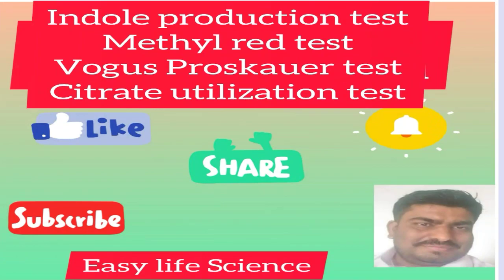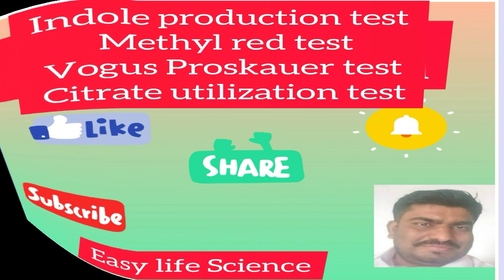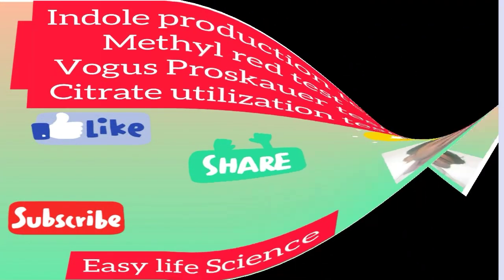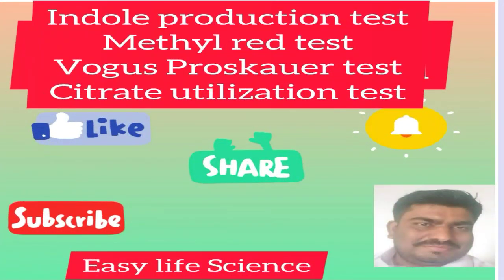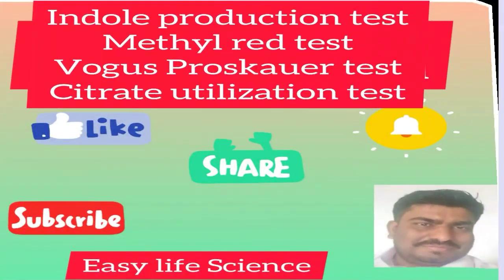The IMViC test is an important test for identification of unknown microorganisms, as well as to find out the origin of water pollution, meaning whether water is polluted fecally or non-fecally. The indicator of fecal pollution of water is Escherichia coli, and the indicator for non-fecal pollution of water is Enterobacter aerogenes.